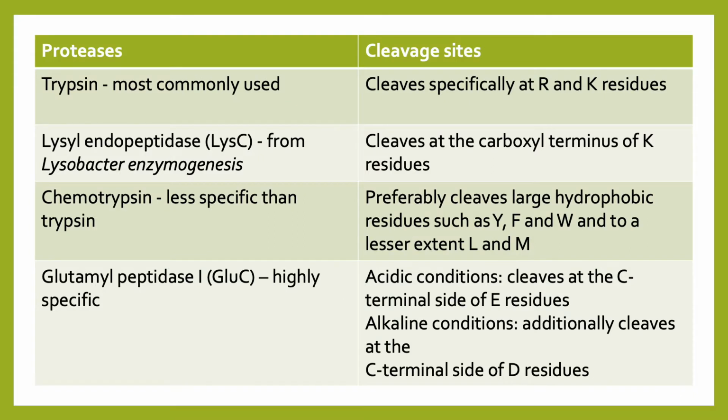Here this table presents some common proteases used for protein digestion in bottom-up proteomics. The first enzyme is trypsin, which cleaves specifically at arginine and lysine residues. The second enzyme is an enzyme from Lysobacter enzymogenes bacteria, Lys-C. This protease cleaves at carboxyl terminus of lysine residue.